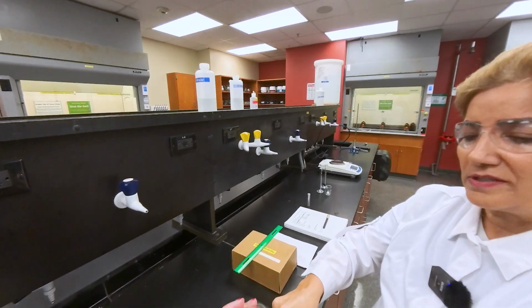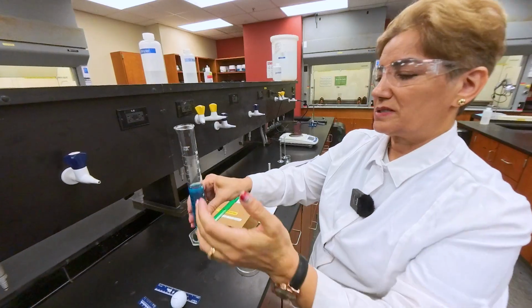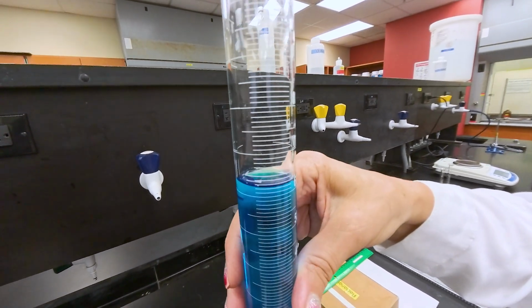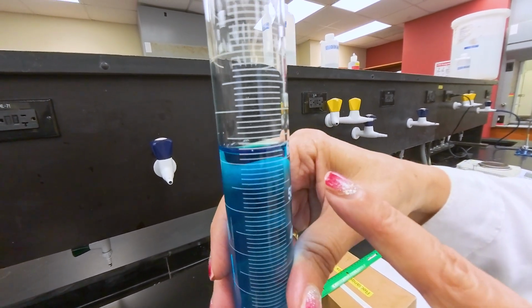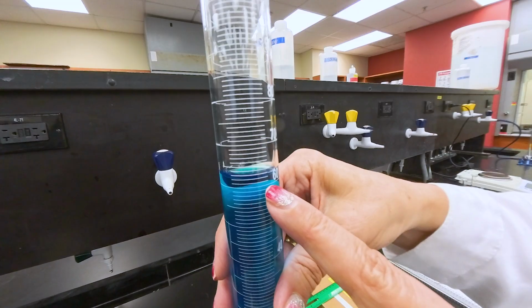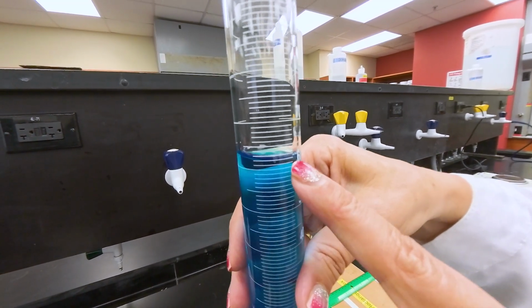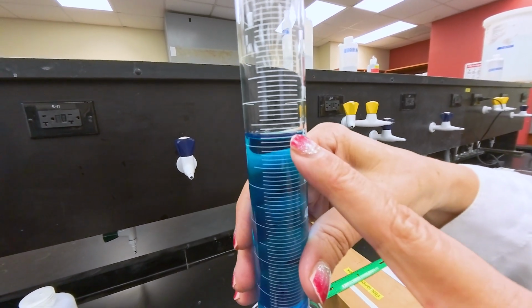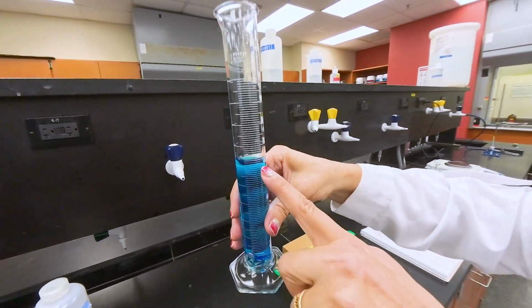add the pieces of the zinc. When we add the pieces of the zinc to this, the volume is going to increase. Of course, the solid is going to displace the water, and the level of the water goes up. We have the final volume, and we record this final volume. Since we already know how to do this measurement, we just look at how many lines higher than 60, and then between which 2 lines, and you estimate that last digit, which is the first decimal place, using the still shot again, or the close-up.